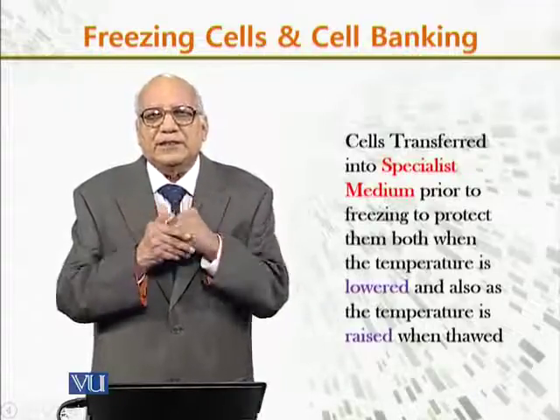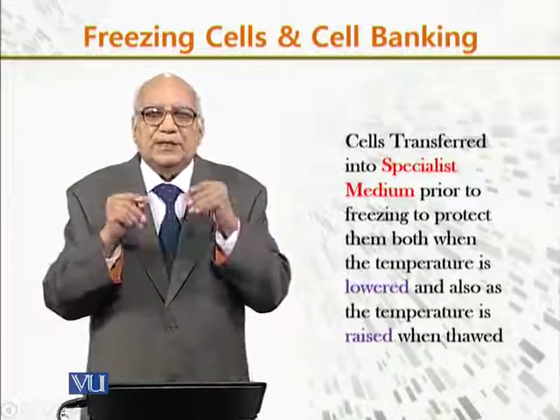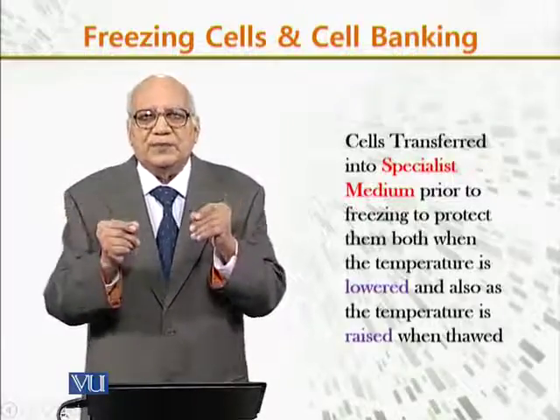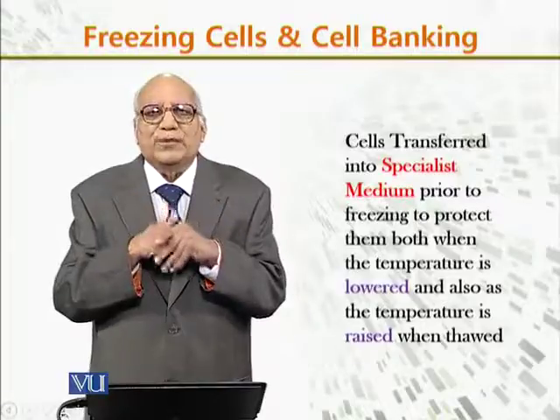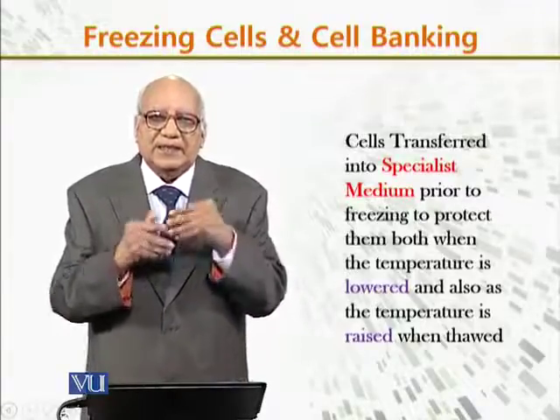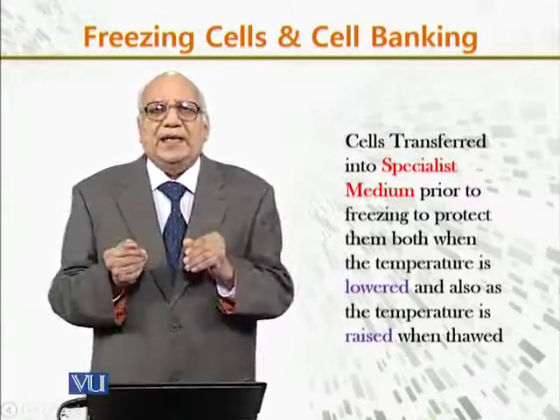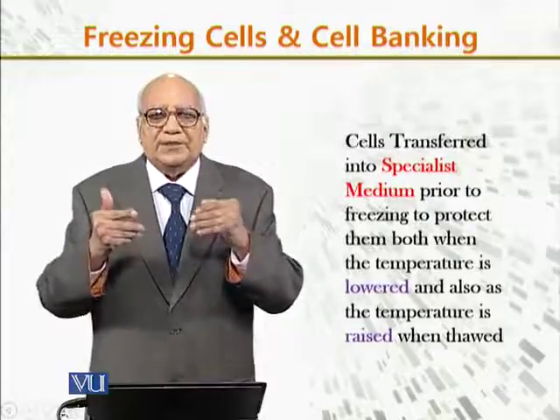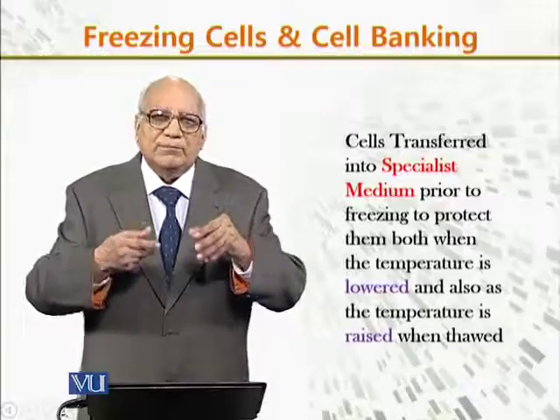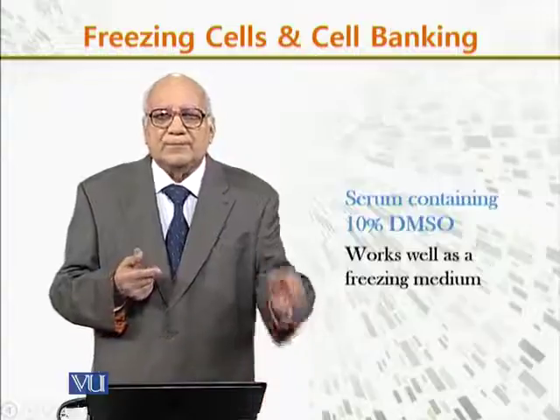So during freezing, there are two processes. One is putting them into a specialized medium, then freezing them at very low temperature. And again, while using them, we have to revive them by raising the temperature so that they are thawed, they are melted, and they are used for this purpose.